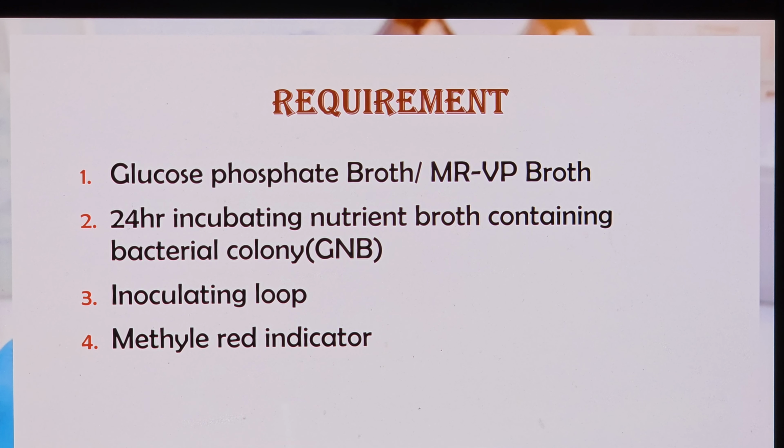Requirement. First, glucose phosphate broth or MRVP broth. Second, 24-hour incubated nutrient broth containing bacterial colony, that is mainly gram-negative bacilli. Third, inoculating loop, and fourth, methyl red indicator.